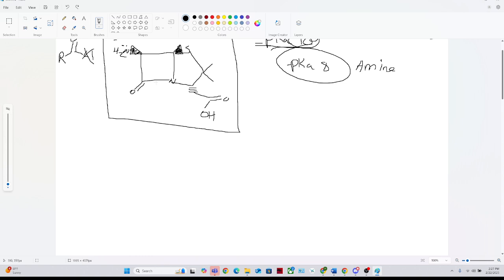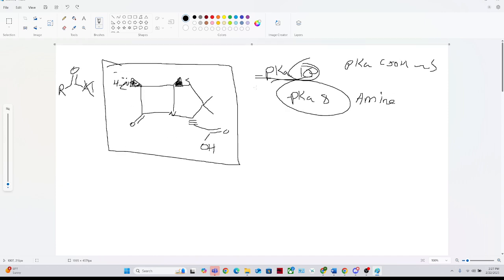The first thing that the procedure tells you to do is what I call charging your solvent, meaning that you add either an acid or a base. In this case, it's a base, so you are making it into a more basic solution using sodium bicarbonate. The reason you want to make your solution basic is really for two reasons. One will be more beneficial towards the workup, but the other is that, remember, the pKa of an amine in this case is probably around 8, and if you know anything about amino acids, in pH 7 they're typically protonated at the amine.